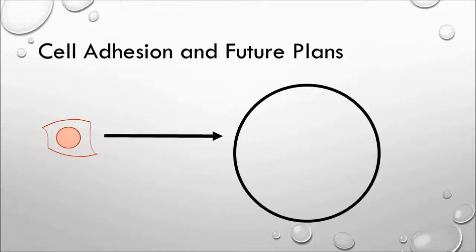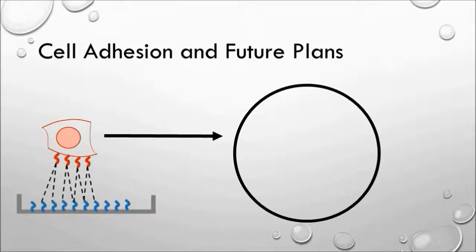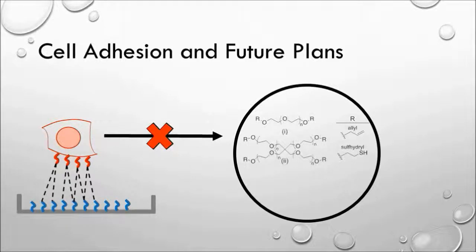However, before the protein levels of cells growing on these gels can be tested, the cells must be given a way to attach. Cells adhere to surfaces through the interaction of their ECM proteins with proteins found on the surface. However, PEG repels proteins and is routinely used to protect polymer particles from protein opsonization. Since the cells would have difficulty growing on PEG alone, the next step for the project is to functionalize and incorporate the necessary proteins into the radical-mediated network.